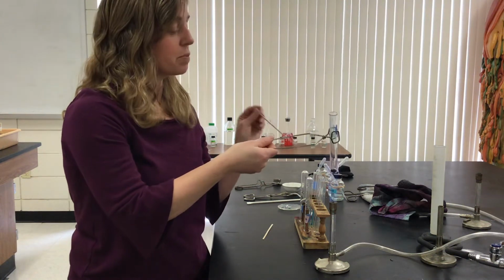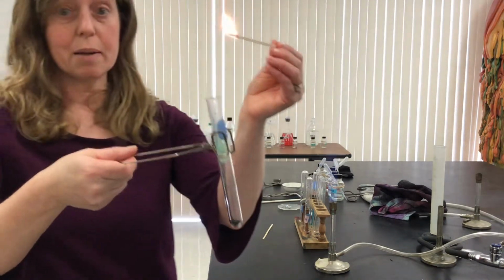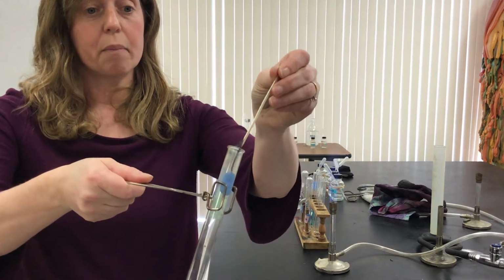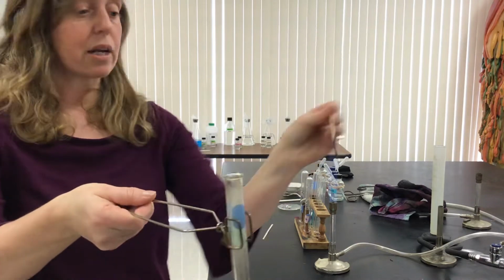Now, when I do this, make sure you watch the color of the flame as it's going to extinguish. So here's my flame. Now I'm going to stick it in here, and you can see a little bit it turns green. It's kind of hard to see, all right? But notice how when I pull it back out, it's relighting, okay? But now if I go a little further, now you see it extinguishes the flame.